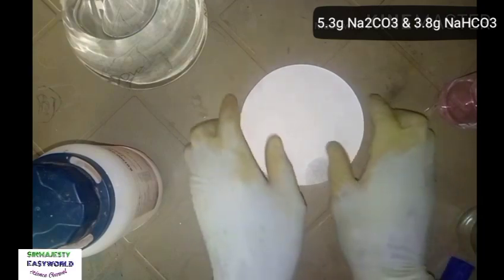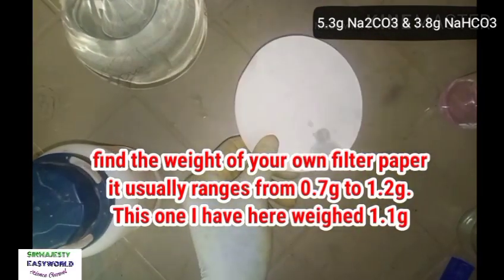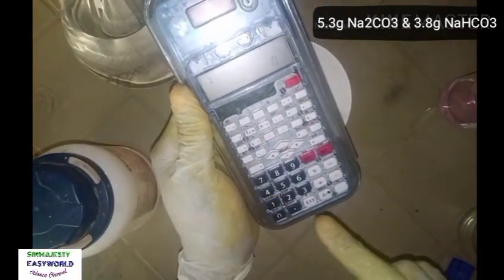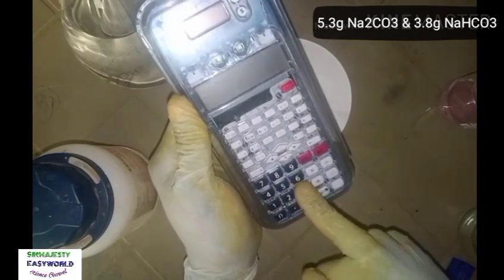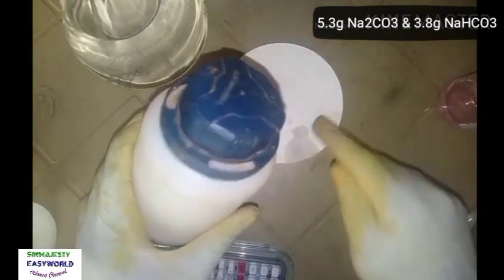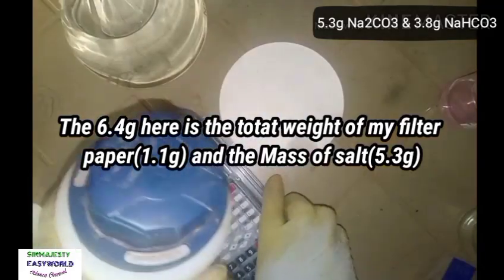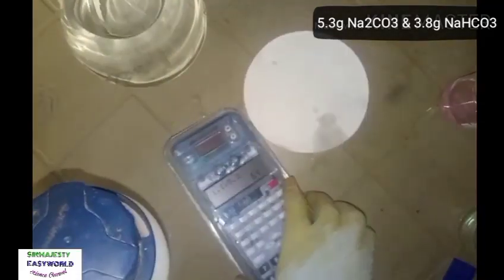So what I'm going to do is put this on a weighing balance. It weighed 1.1. First of all, what you have to do is just add 1.1 plus 5.3. Over here you have your 6.4. So you place this on an electronic balance and keep adding this sodium carbonate until it reads 6.4. If it becomes more than 6.4, you use your spatula and scoop the excess back until it reads 6.4.